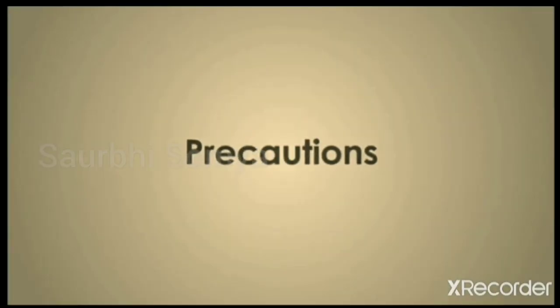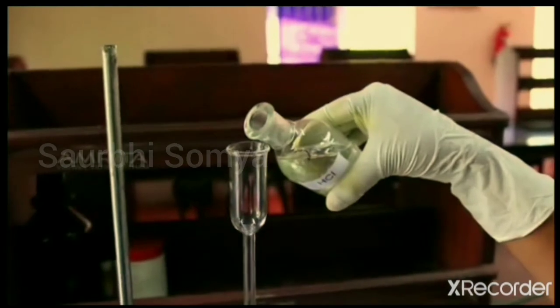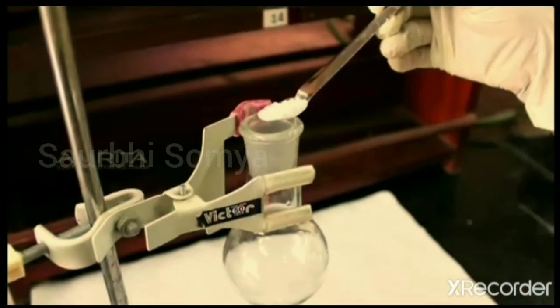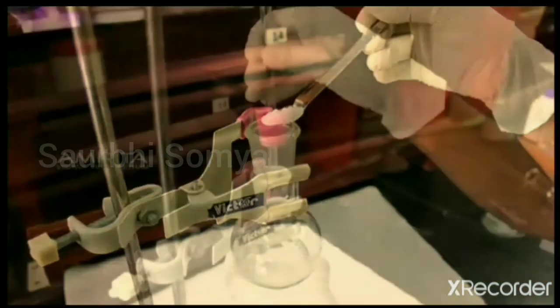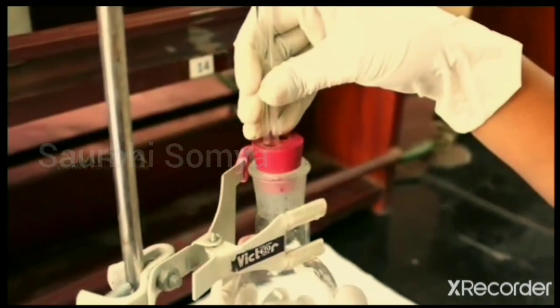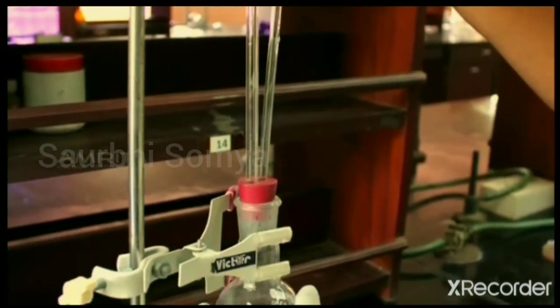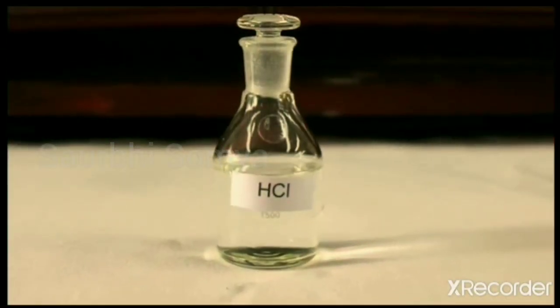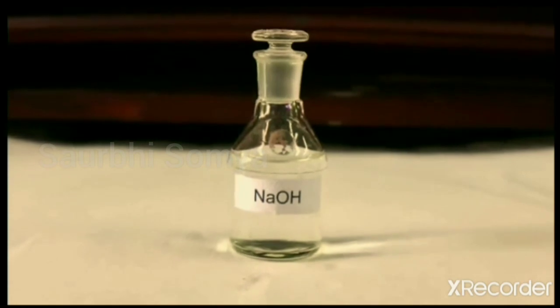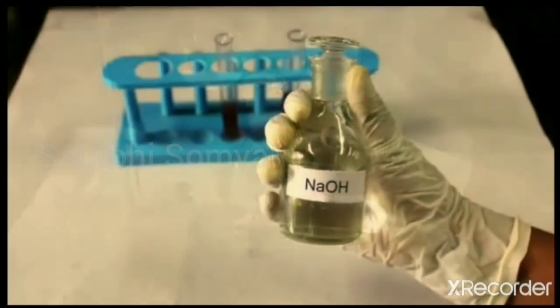Got it? Now, what are the precautions you need to take care of while doing the experiment? Add HCl to sodium carbonate only after making the apparatus airtight. Otherwise, the gas evolved in the reaction will get away through the gap. Handle the chemicals HCl and NaOH carefully as they are harmful. You know that they are strong.